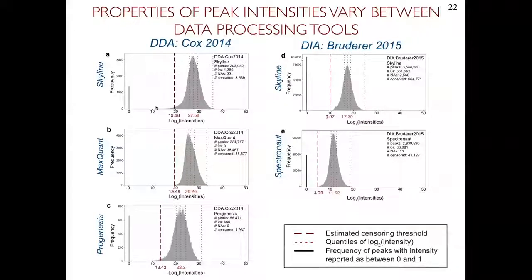The only exception is Skyline, because Skyline actually makes a distinction between things missing for reasons of low abundance versus missing for other reasons. So for example, if you have peaks which are highly overlapped, or in SRM you have a scheduled transition, but it's kind of got missed and you only see a portion of the peak, but not the entire peak, you cannot quantify this. Skyline reports NA to say, I cannot reliably quantify the peak, but the peak is there. For everything else, it will be value 0 or very close to 0 value. And so in the special case of Skyline, we leave NA untouched.